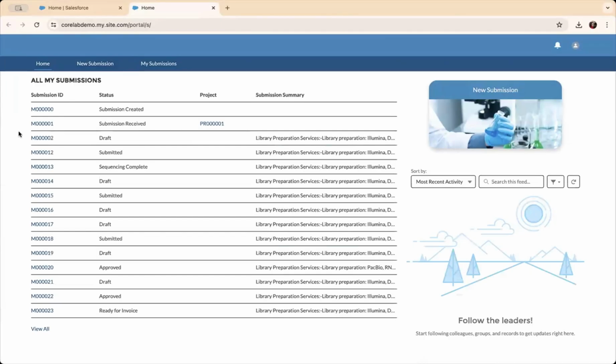I have a button over here. I also have this tab. They're going to take me to the same place. So this is called a screen flow.